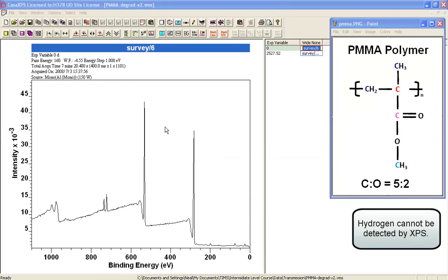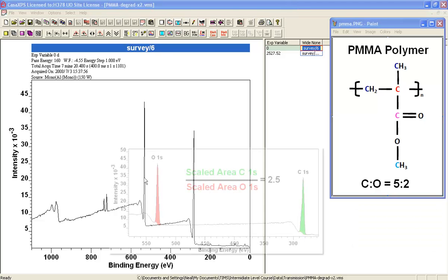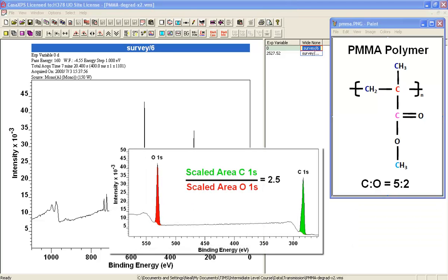In terms of quantification from XPS, when we measure the peak area for oxygen and carbon, if we scale them appropriately using relative sensitivity factors, escape depth correction, and transmission correction, we should get the ratio of five to two.